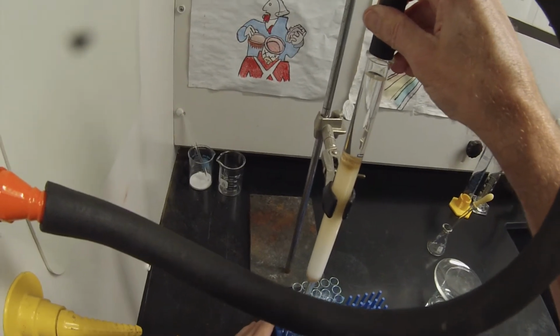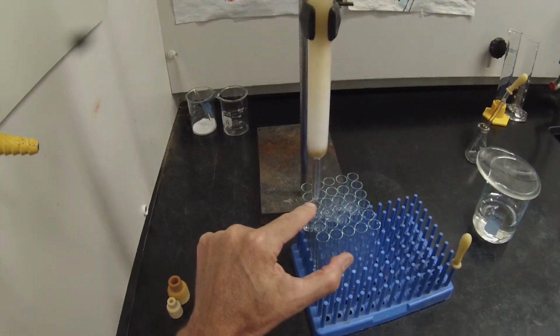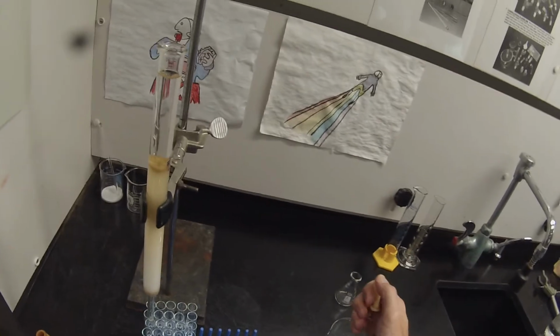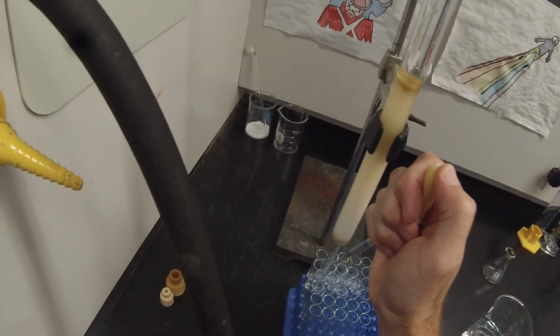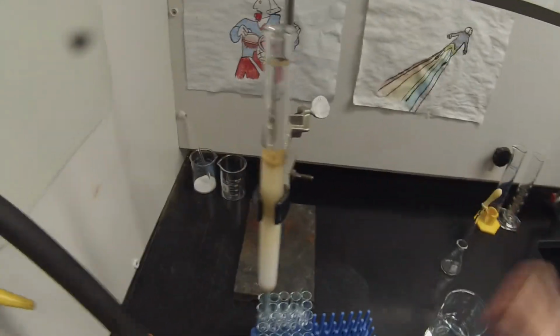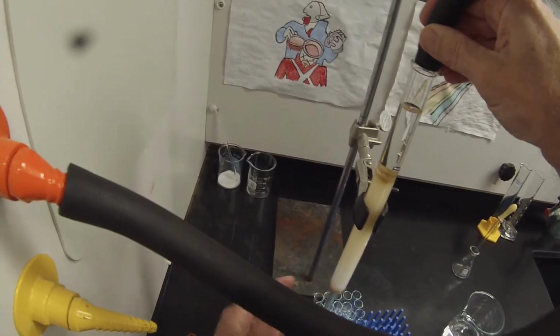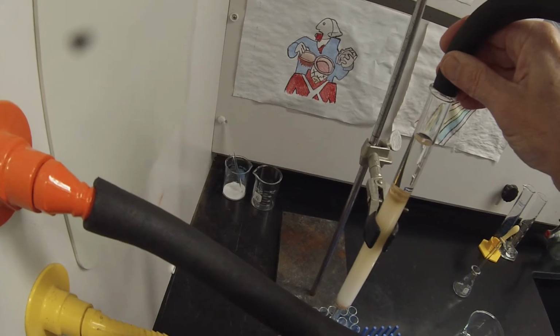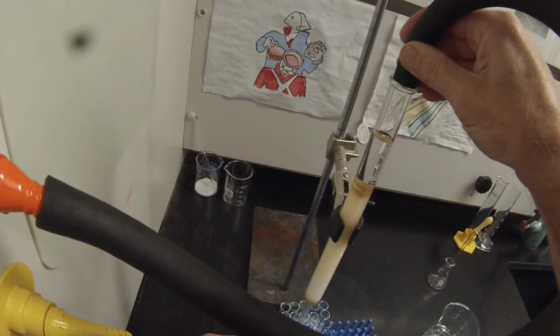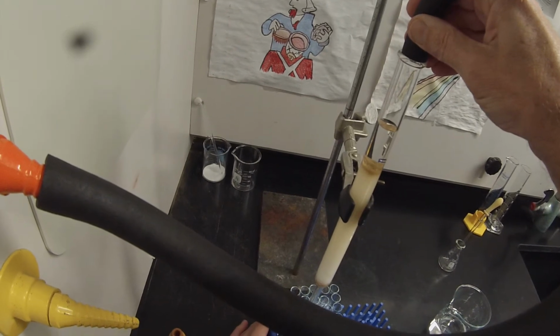Sometimes when you're doing solids, especially with really volatile solvents like these, you'll notice a little bit of solid collecting around the tip. And I want to make sure that that solid goes with this fraction rather than, you know, waiting until the next fraction. So it's sometimes worth rinsing the tip a little bit. And what happens is the solvent kind of crawls up there. So I definitely have something coming off here in tube number 11, because I can see that solid collecting.